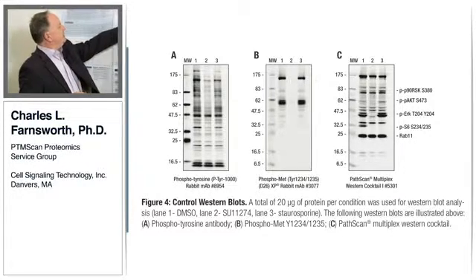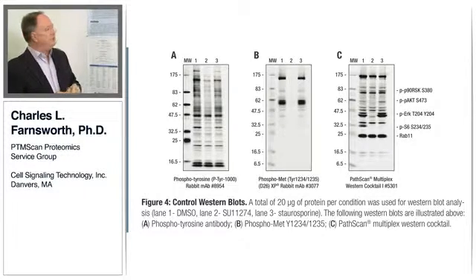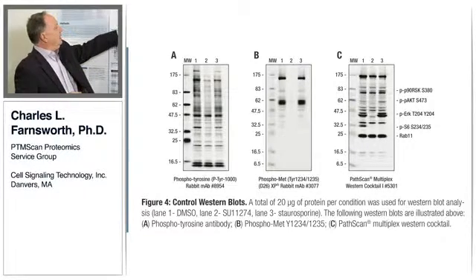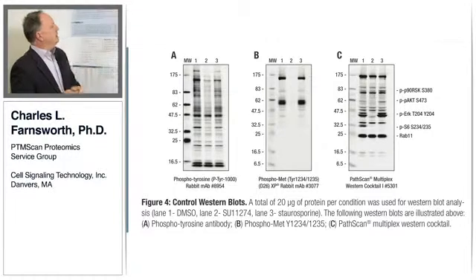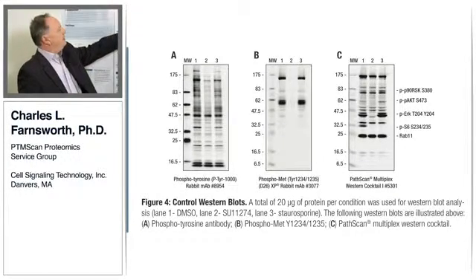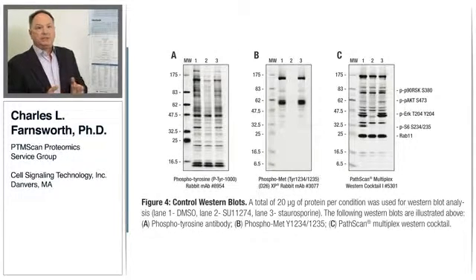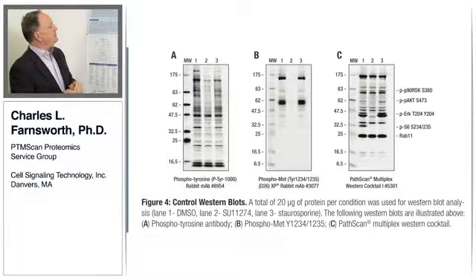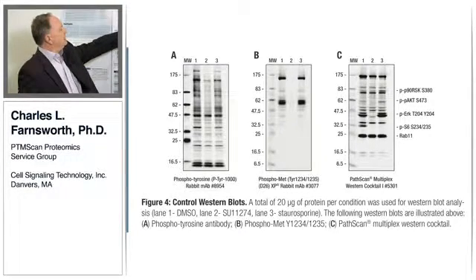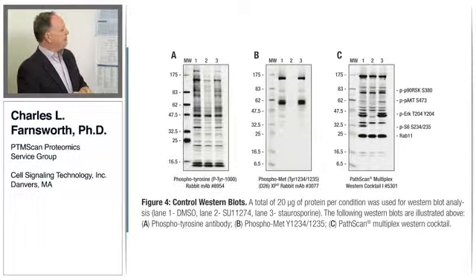We can see that AKT in lane 2 is significantly reduced in phosphorylation. And also the MAP kinase ERK. And we can see in lane 3 that there's actually a modest increase in phosphorylation and ERK signaling, suggesting a known crosstalk between the 2 signaling pathways. It should also be noted that phospho-S6 is reduced in both experiments as to be expected.